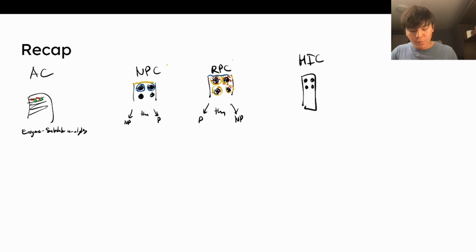And on these beads, we had hydrophobic side chains for them to bind to, right? Hydrophobic ligands. And we had proteins. We add our protein in, and our proteins will bind to these ligands, right? And we have a very, very high salt concentration in our mobile phase.